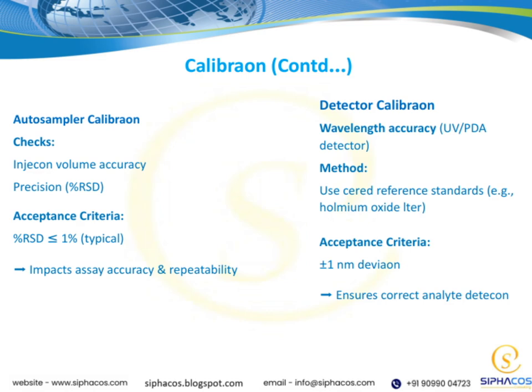In summary, these calibration steps are fundamental for maintaining the integrity of our analytical method, ensuring that every measurement is accurate and reproducible, which ultimately supports the overall quality of our data.